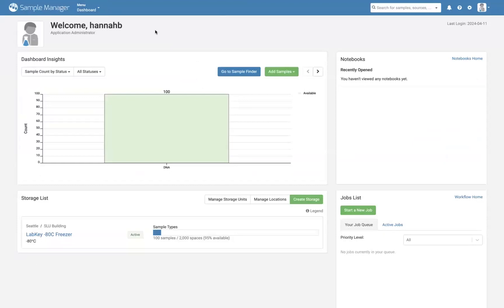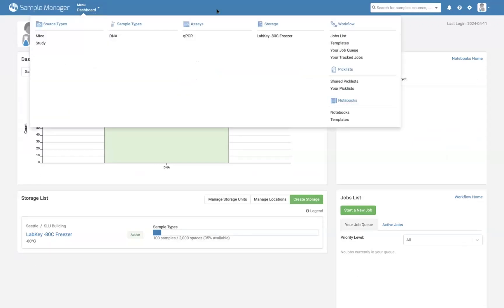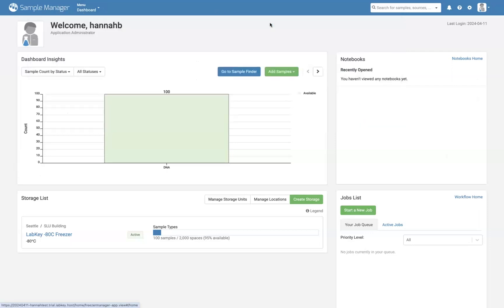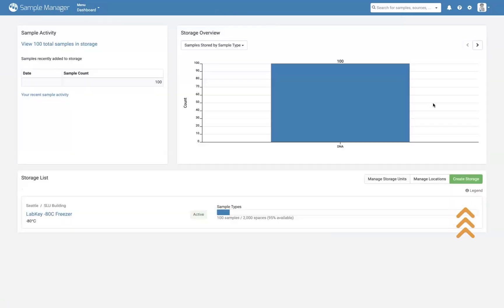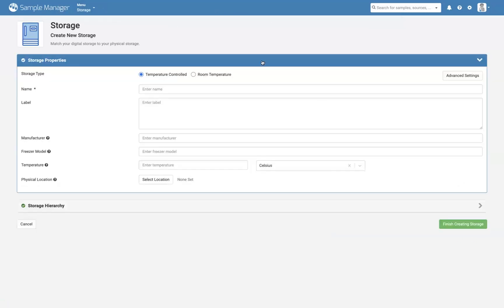To track physical locations of samples and storage, administrators can define new freezers and other types of storage quickly. To create a new freezer, select Storage from the menu, then select Create Storage.